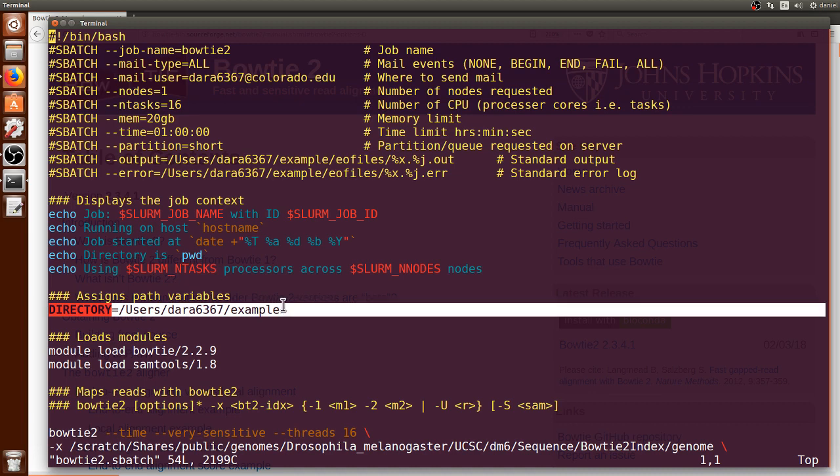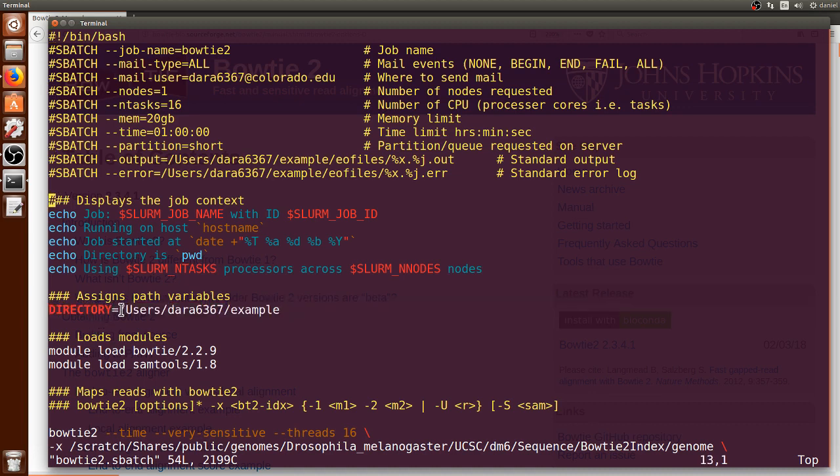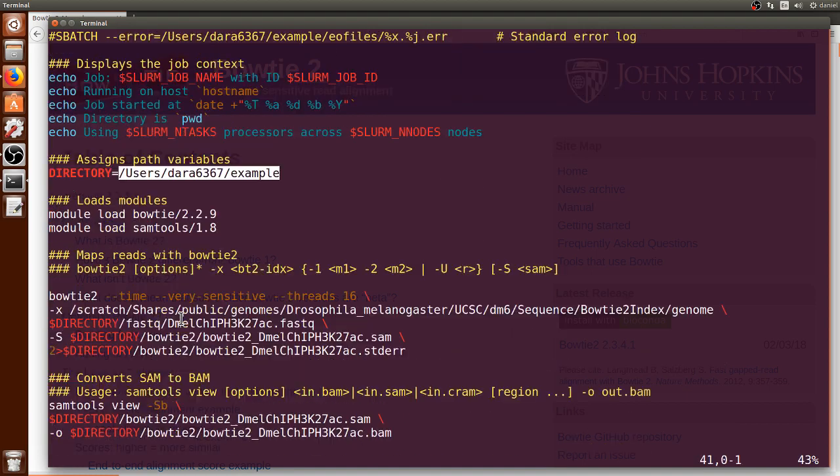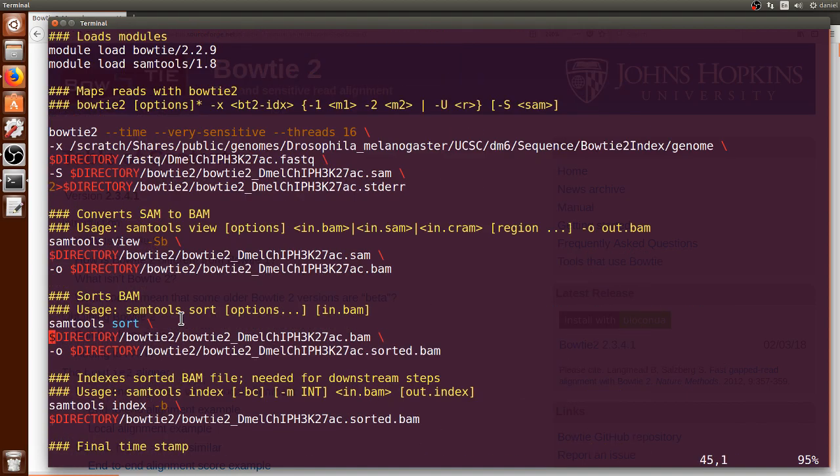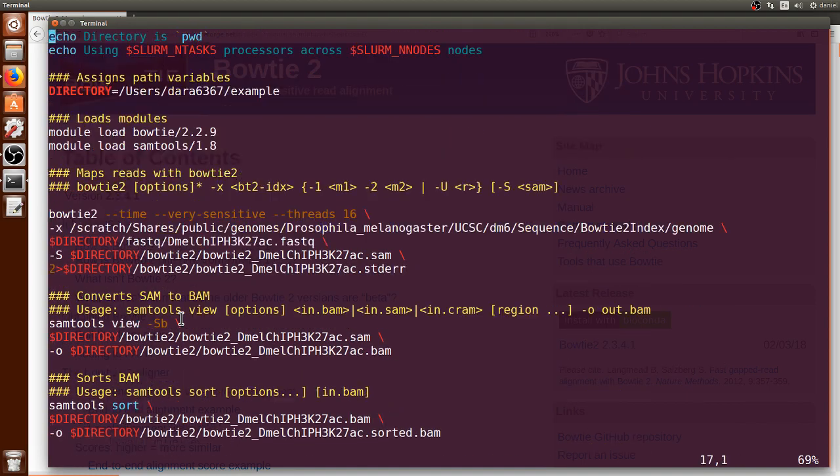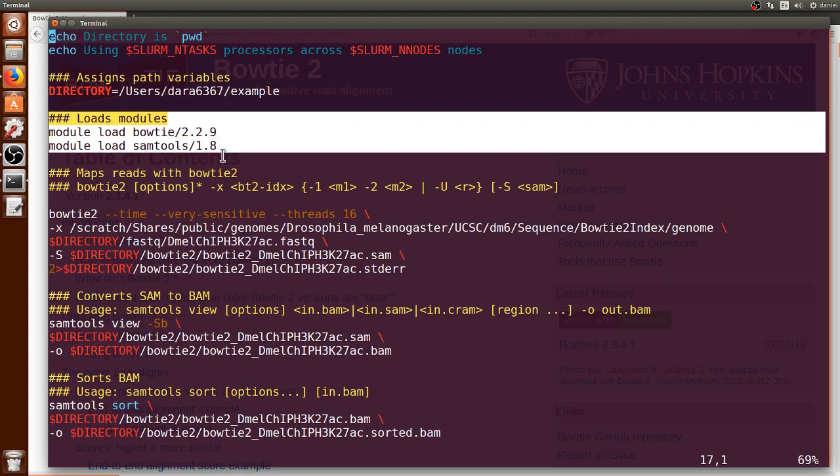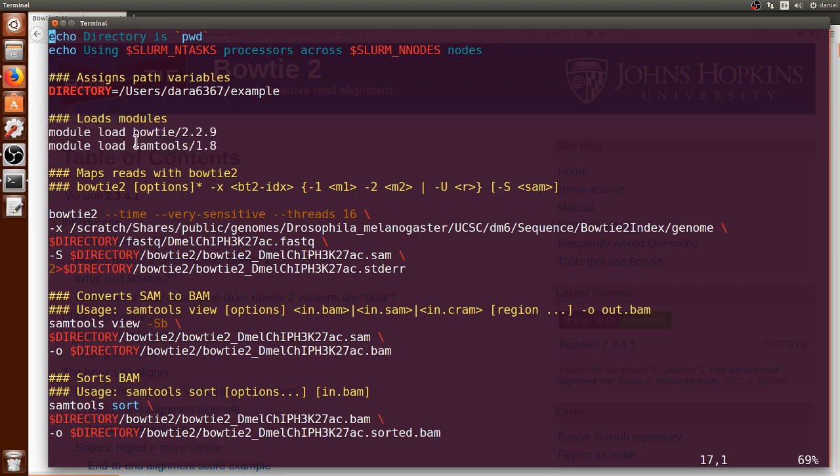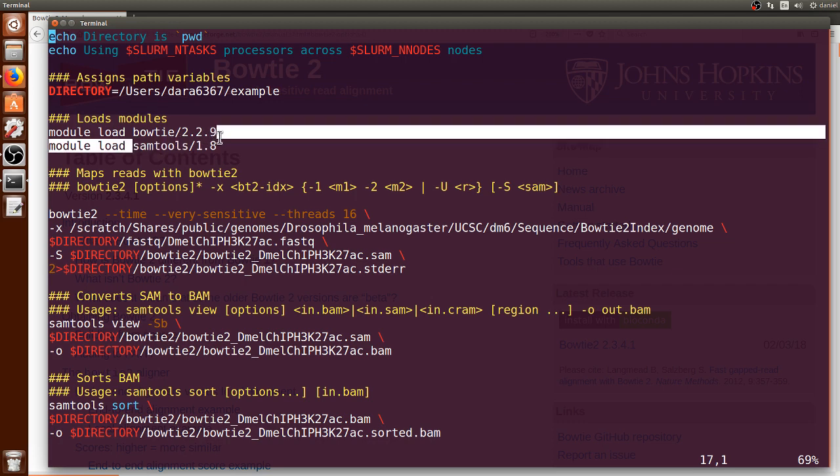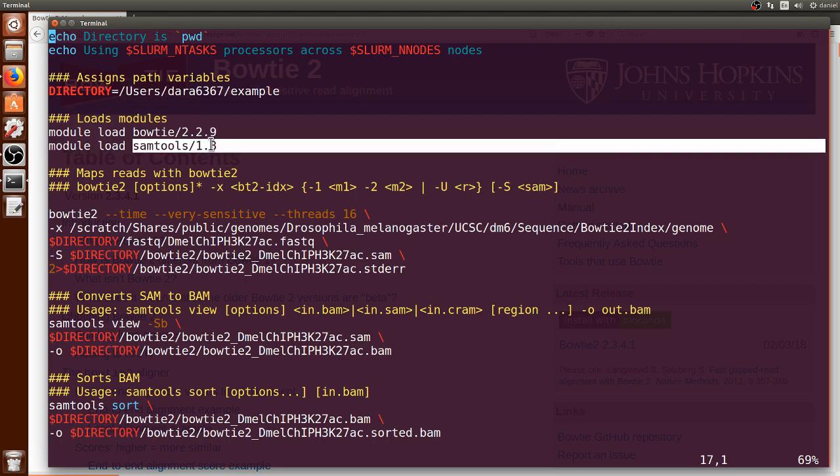Here I am specifying the variable directory that contains this portion of text that is a path that I will be using throughout this file. We go down a little bit and now I am here loading modules that this job will require in order for Bowtie2 to be utilized along with samtools which is another set of tools software.